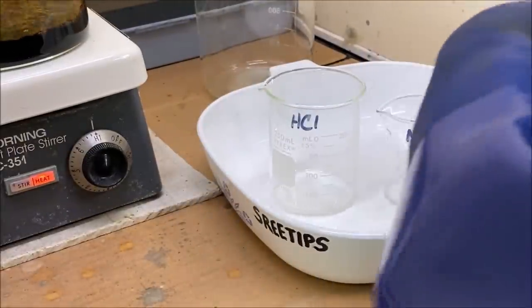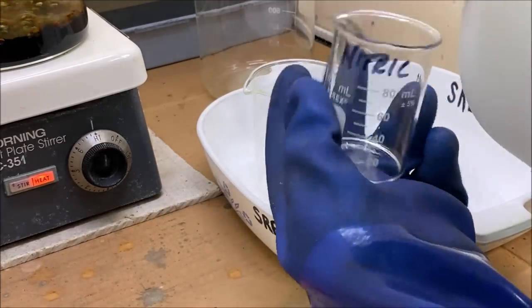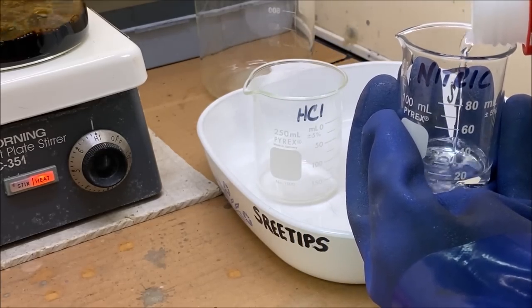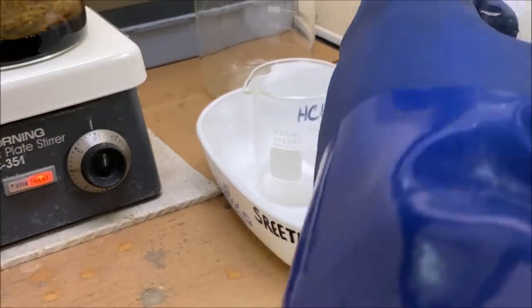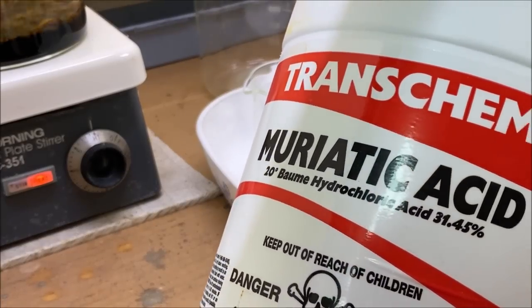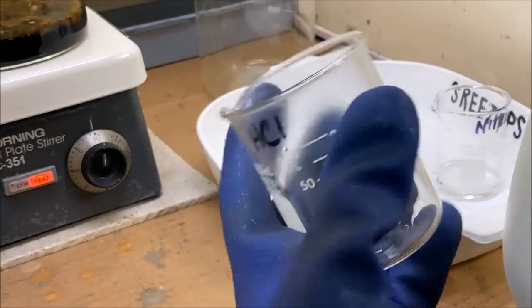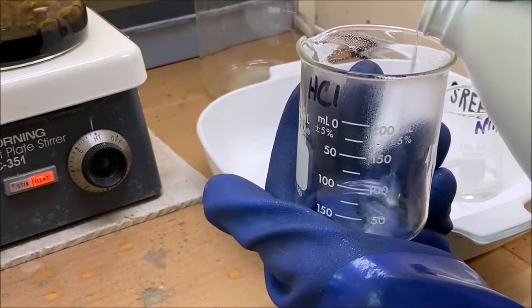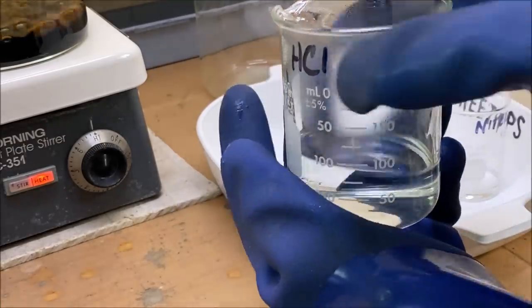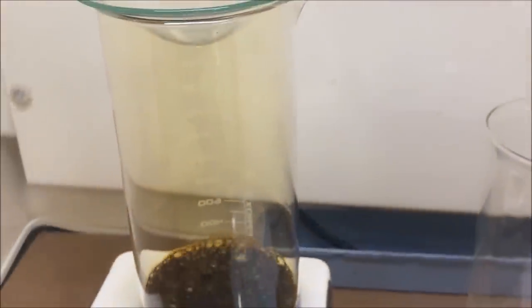I'm gonna measure up a little bit in this beaker. Maybe about 20 milliliters or a little less even. And now we're going to measure out another 100 milliliters of hydrochloric acid. Maybe about 75 rather. And I'm going to go ahead and add these into our reaction now.